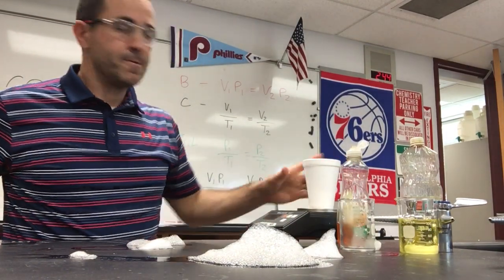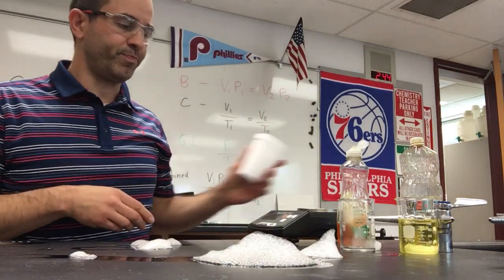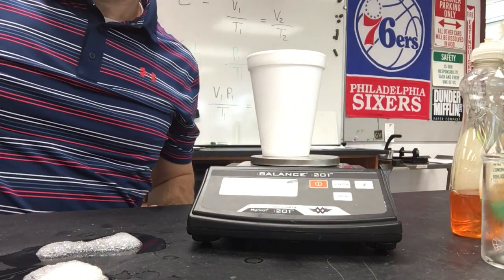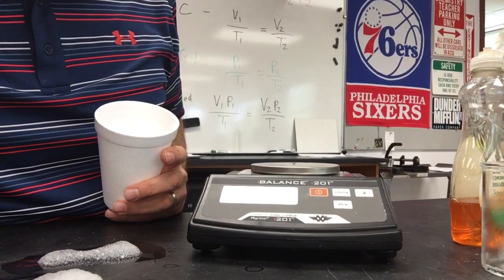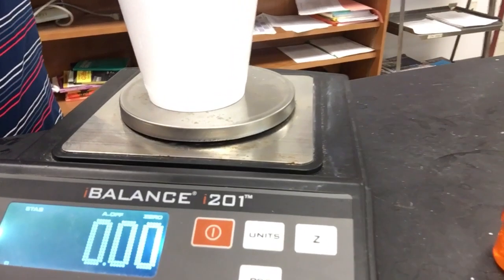So here's what we're going to do in our lab today. We want to weigh the piece of dry ice. I got my scale here — let me slide this up and keep it out of the puddle. We're going to put a piece of dry ice into our cup, and we need to know how much the cup weighs. I'll pick this up once the scale turns on, put my cup on, press the tare button, and our scale is reading 0.00.